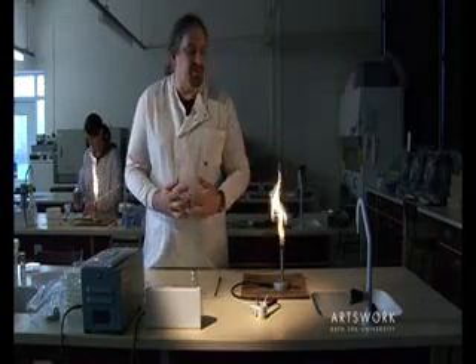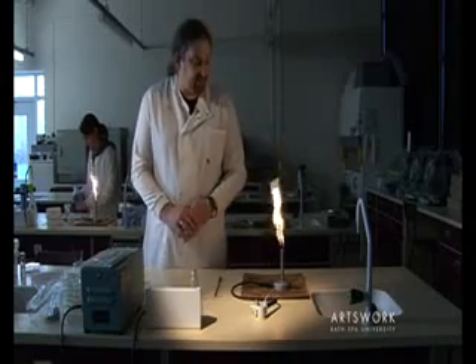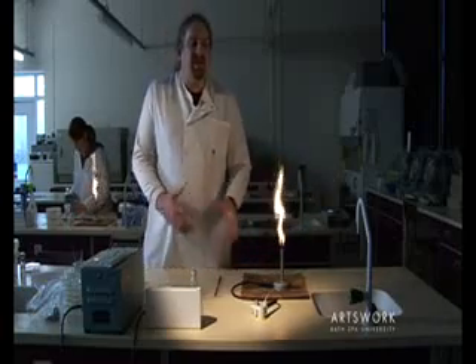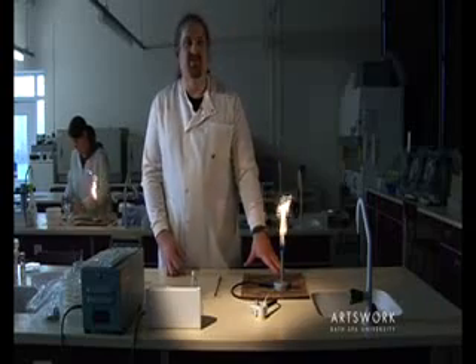You'll be using the Bunsen burner a lot during your microbiology sessions. A couple of key health and safety points: whenever you are not using the Bunsen directly in your practical work, either turn it off or leave it on the yellow visible flame.